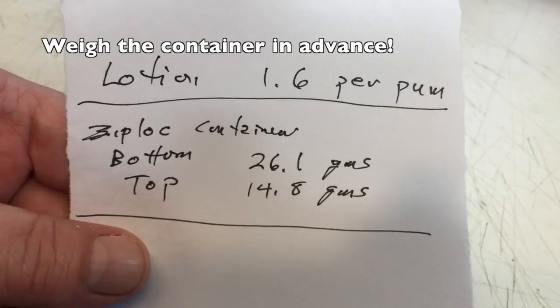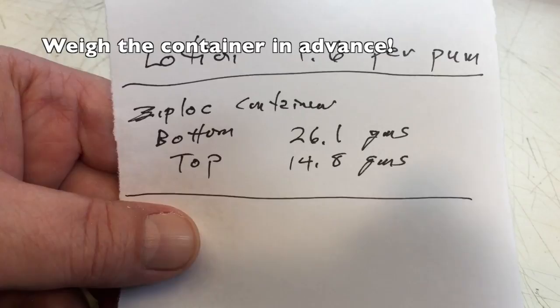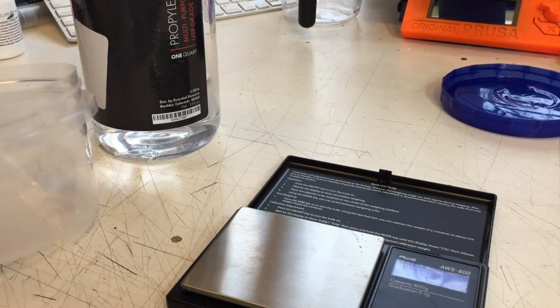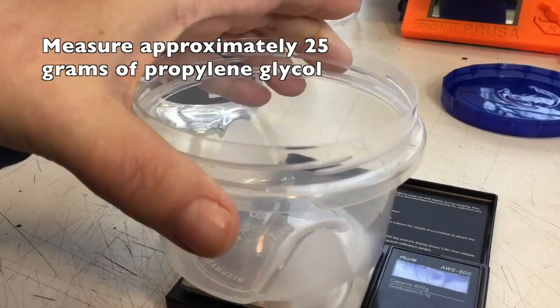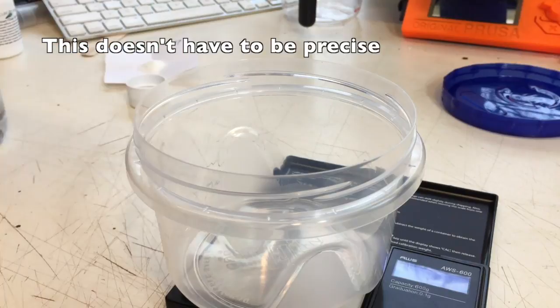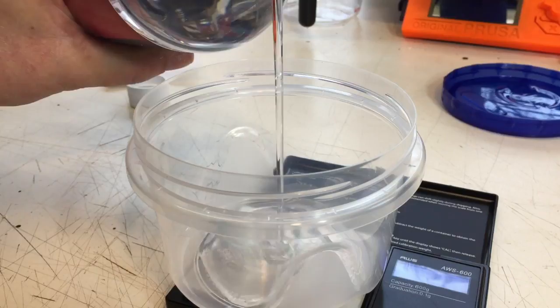Before I got started on camera, I measured how much each squirt of lotion came to. With this Ziploc container, the bottom weighs 26.1 grams, so when I toss it back on the scale I know exactly how much it weighs. Now I'm going to measure out some propylene glycol into a nice little Ziploc storage container — I hit the tare button to zero it out — and I want about 20 to 25 grams of propylene glycol.